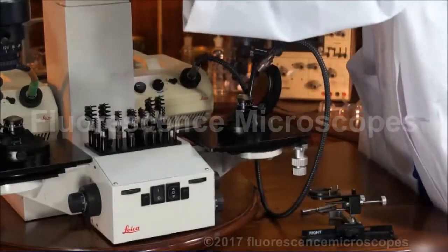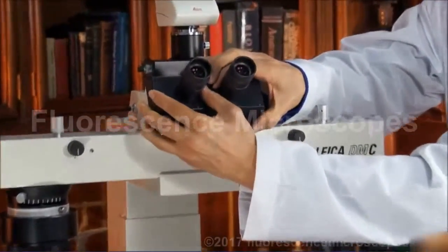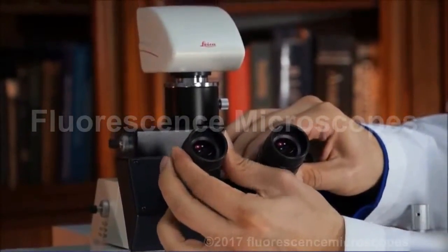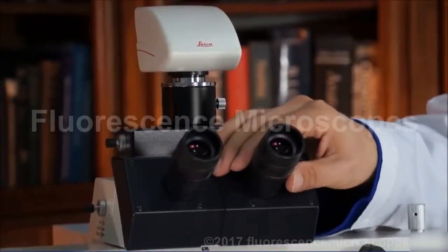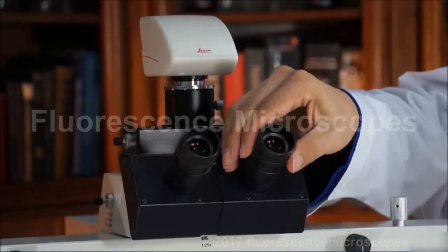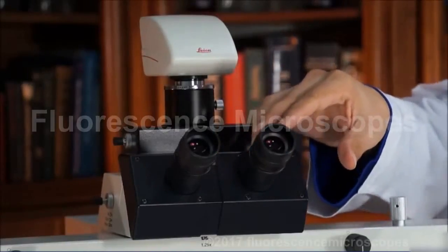You've got the interpupillary distance that can be set for these eyepieces, and you have diopters — one for each eyepiece — to get the eyes in sync. So if you get everything focused on the left side, you can adjust just this to synchronize it so it's also in focus on the right side.